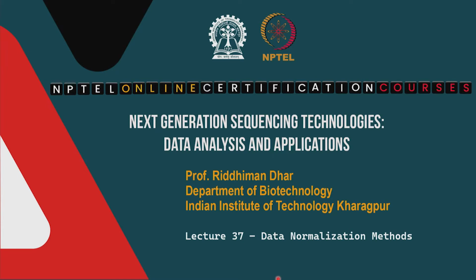We will introduce more and more sophisticated methods for data normalization, and in this class and the next class we will talk about different types of normalization. For example, we will talk about within sample normalization, then between sample normalization when we have multiple samples within a data set, and then finally we will talk about combining different data sets and doing something called batch correction.